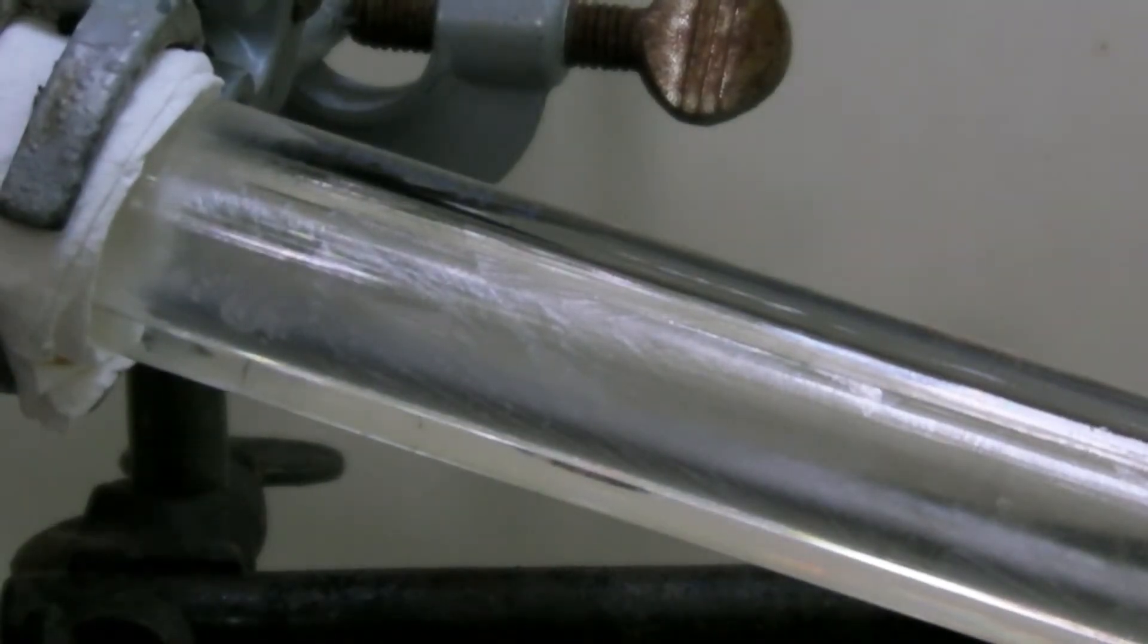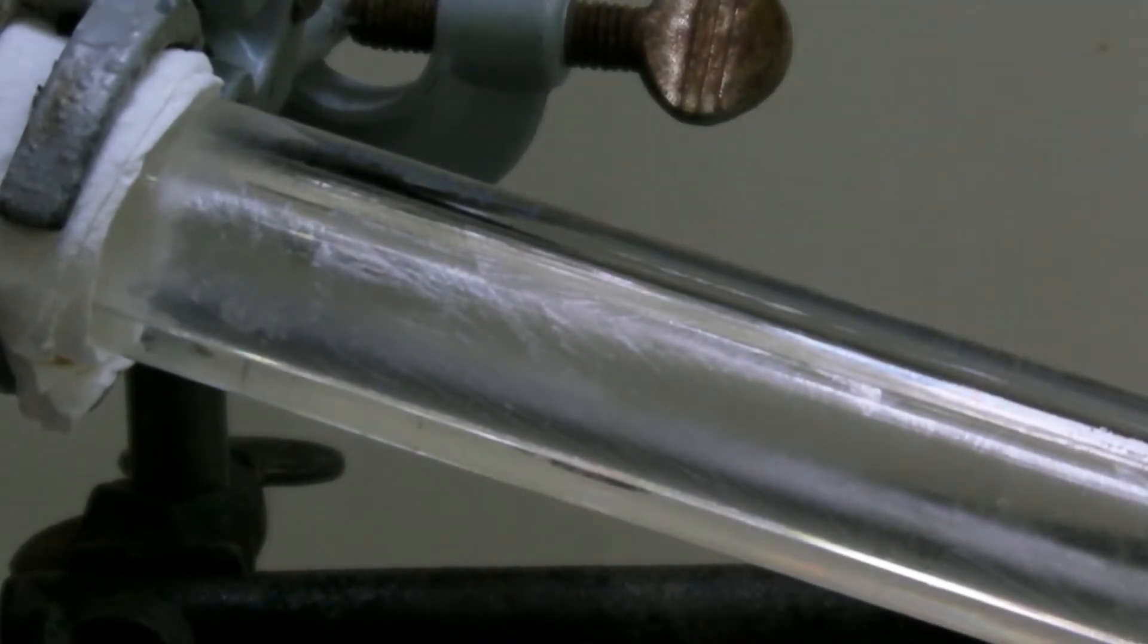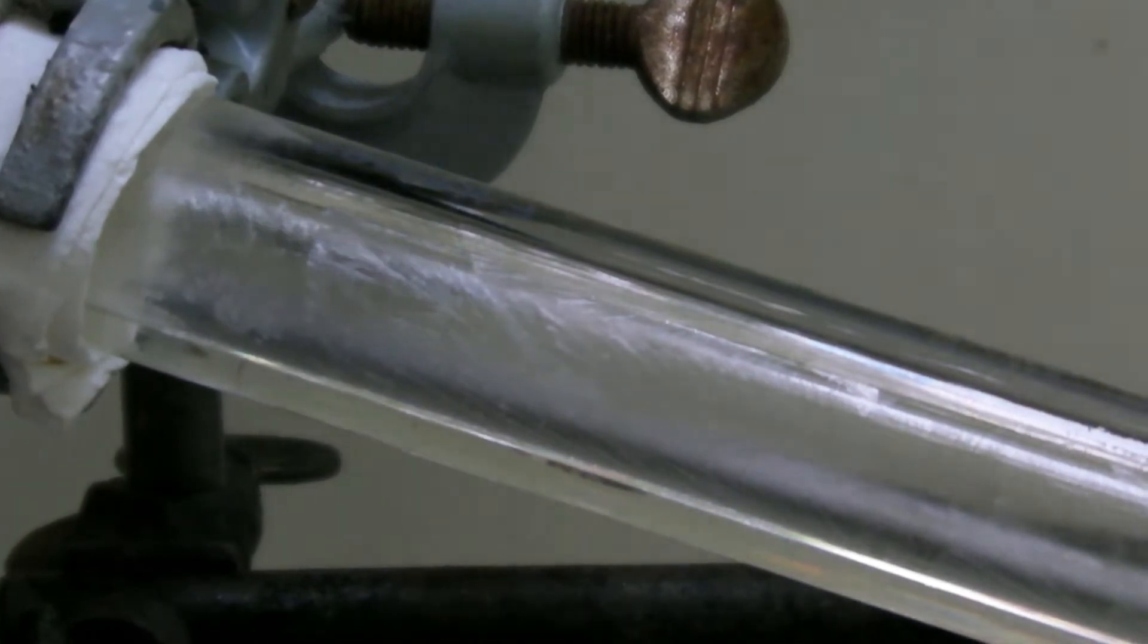Then needle shaped crystals began to form in the condenser, which was a sign that the temperature of the cooling water was too low.